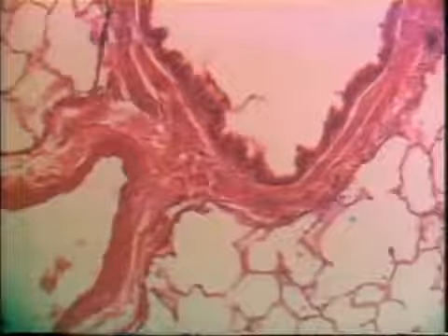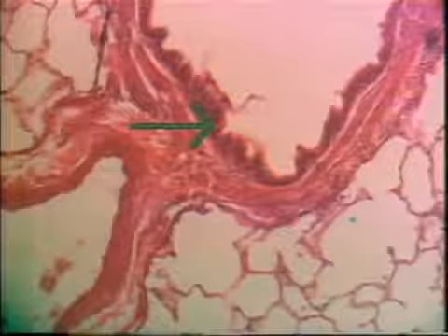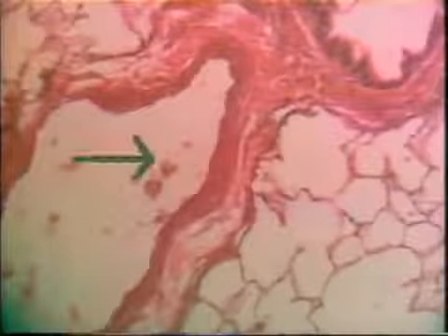Let's go to a higher power of this to see the definition of a bronchiole. There's the bronchiole, upper right, and the pulmonary artery. Now you can see, scan around here a little bit, the absence of large glands, no cartilage.